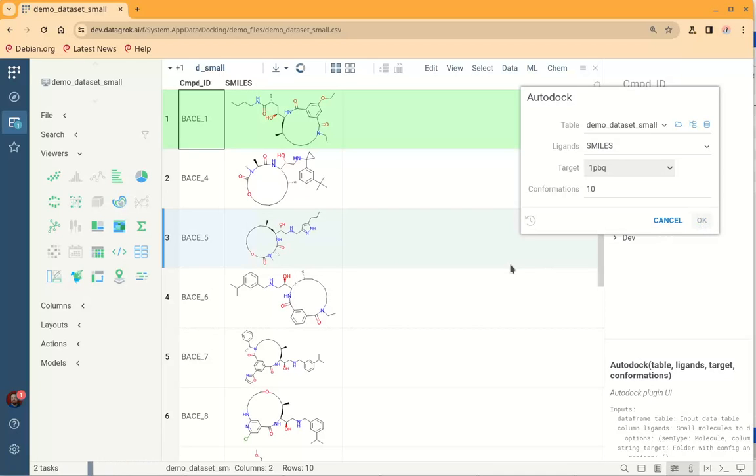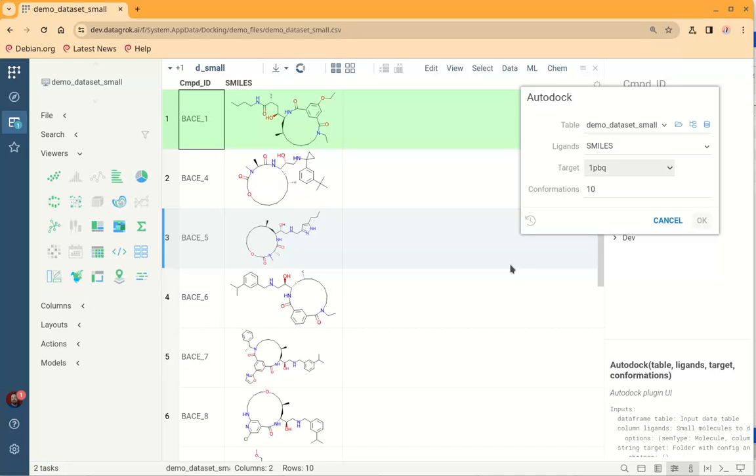First calculation will take a while because Auto-Dock prepares affinity maps for the macromolecule and this is a time-consuming process, but all subsequent runs will be notably faster because Datagrok caches affinity maps and we won't need to recalculate them.